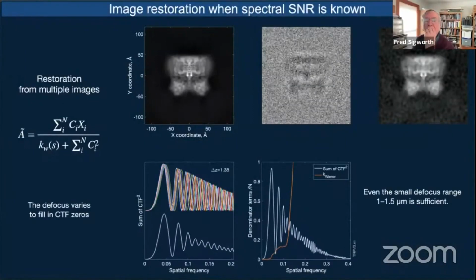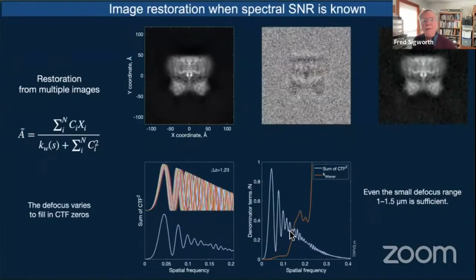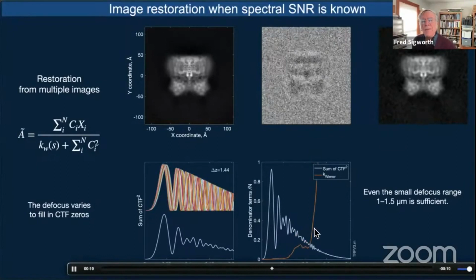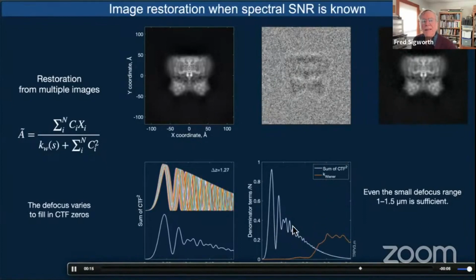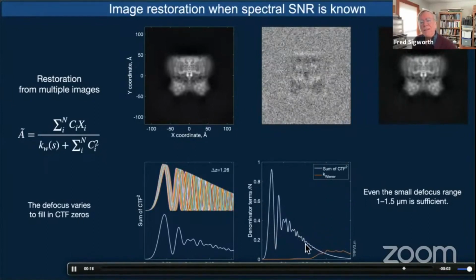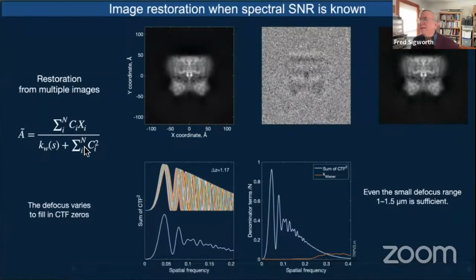more and more terms, you can see what happens is that the importance of the KW, this regularization constant, becomes smaller and smaller. And the CTFs from all of the various images add up together. And so when we get this beautiful reconstruction, this is gotten because in the denominator, this is really contributing the most. And this combined with that is the deconvolution that we were seeking.